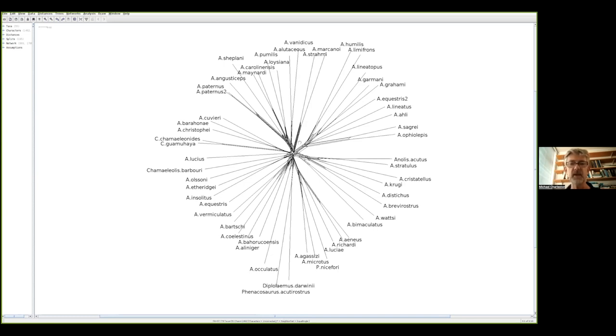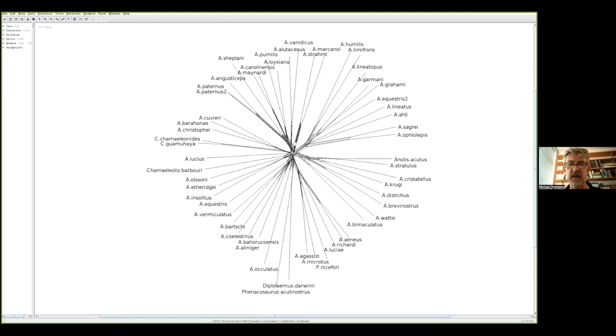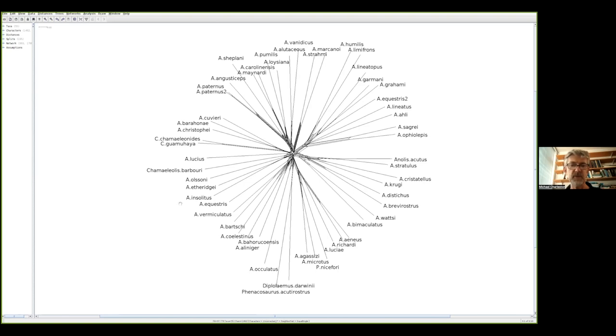I've loaded the alignment file into SplitsTree4 and this is the first figure that I've got. You might be wondering what is that big mess in the middle? We're definitely going to cover lots of details about what that is, but to start with you can see the taxon names around the outside. This is an unrooted structure similar to the circular tree layouts that we saw before.